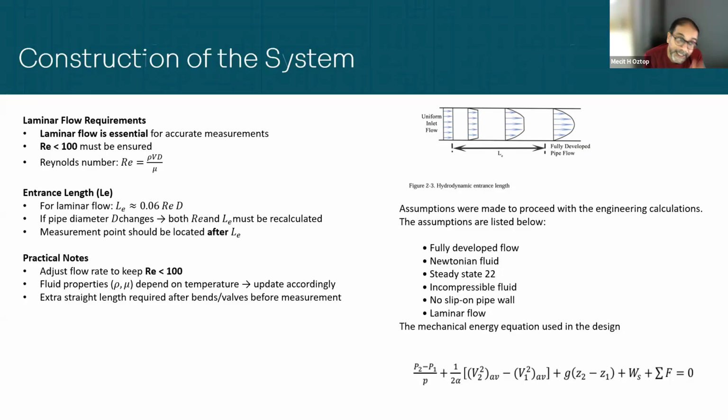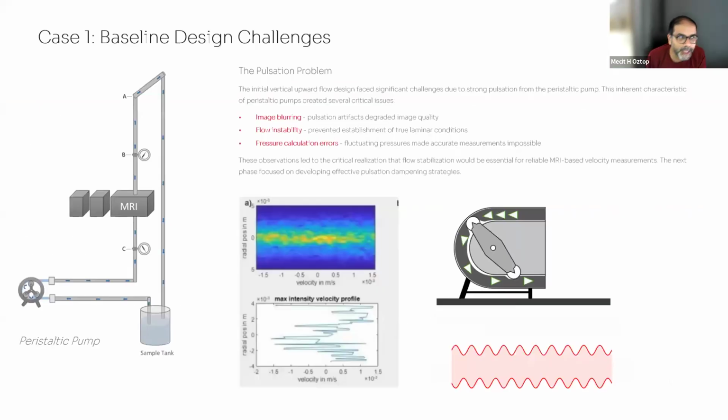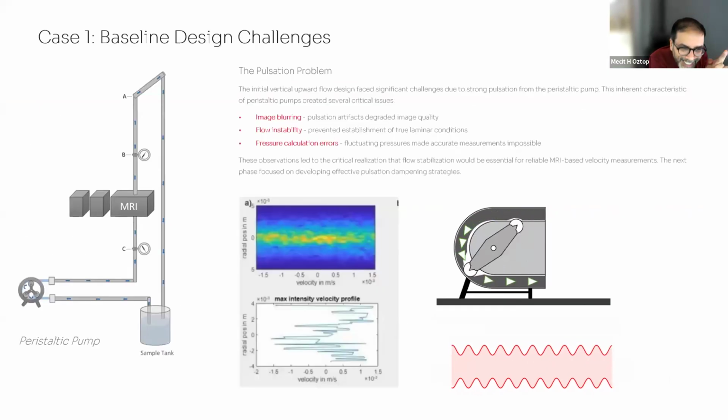And of course, while making the design, we used water, since with water the system will be at the maximum length, and the viscosity of water is smaller compared to most of the other foods. So that is why we made our design calculations with respect to water by using the Bernoulli equation. Well, the schematic representation of our system is shown here.